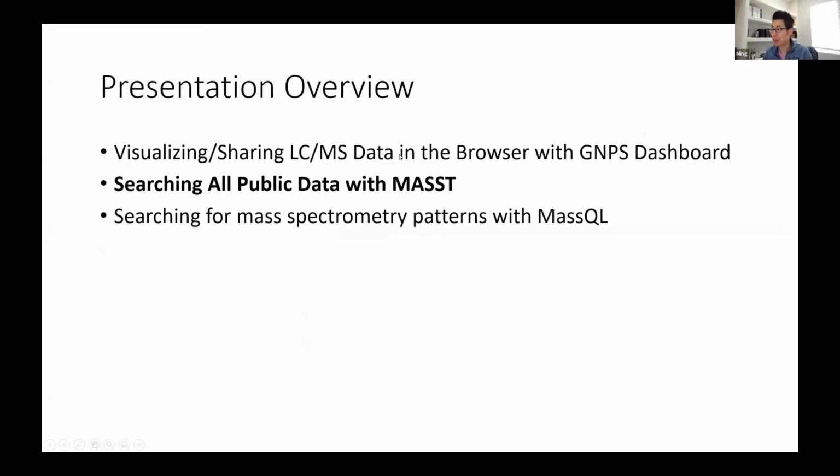And so the very first thing, let's see a question. Is there a way to see sample information about samples? If we're looking at public data, there is, and that's a tool called Redu. We'll take a detour into that in just a second. What we'll first start doing is move on to the second section, searching public data.